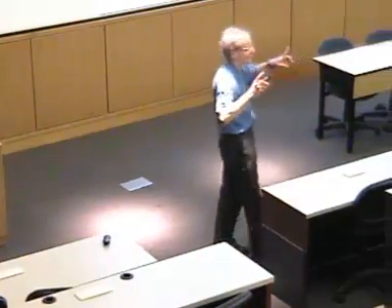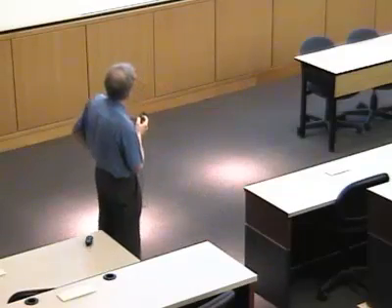This fellow, John Brandts, is one of my heroes because he was one of the founding fathers of biomolecular calorimetry. He founded MicroCal, and his guidance made that a company that provides a very nice product. These papers here are really the seminal papers on how to use calorimetry, ITC, to study metals binding to proteins.